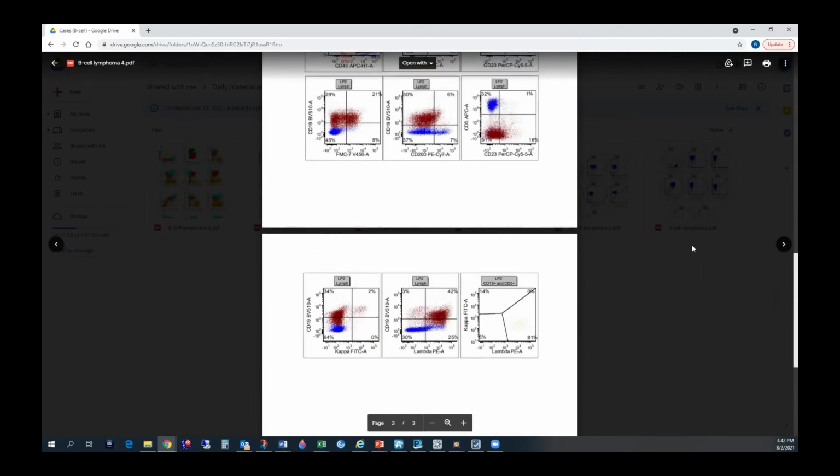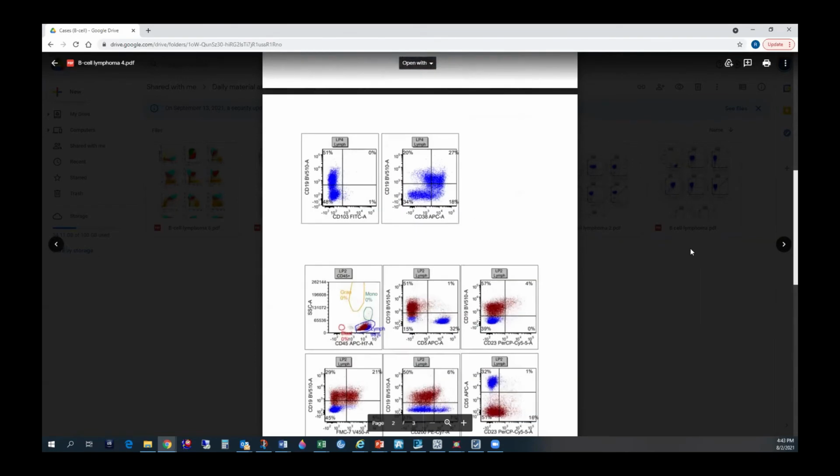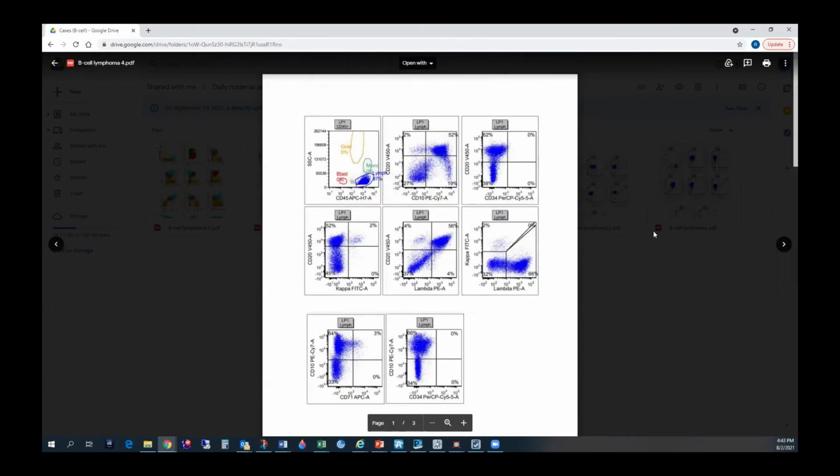Yeah, so I was more on the follicular lymphoma on this, and I think it's a germinal center, so that's why we kind of see a spectrum of things over here, because we have other cells in that. So that's what I was thinking. Okay, yeah, this one is follicular lymphoma, and you do see that the side scatter is not increased, and it is of smaller size cells.